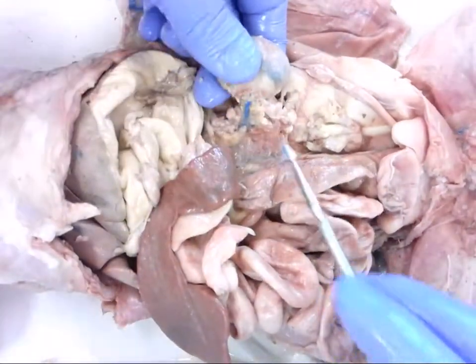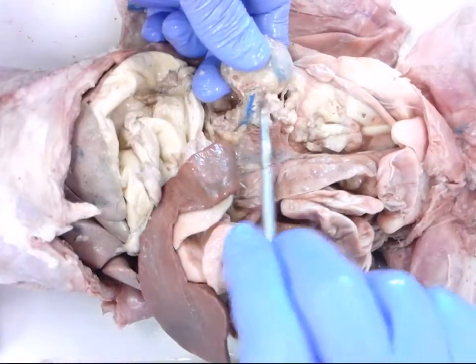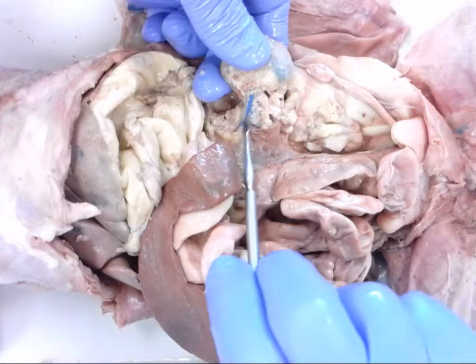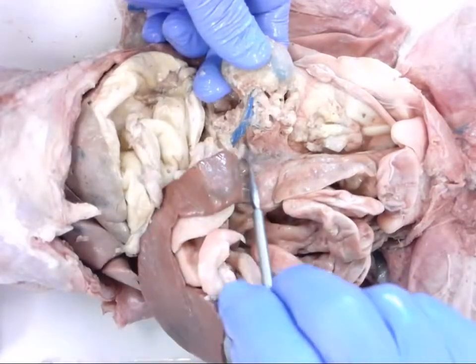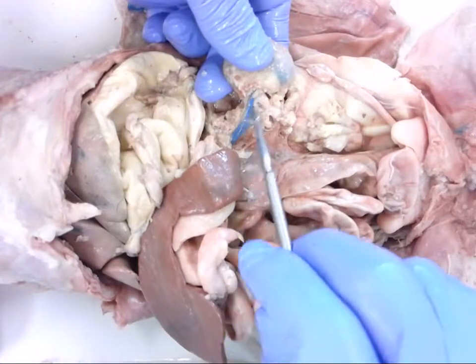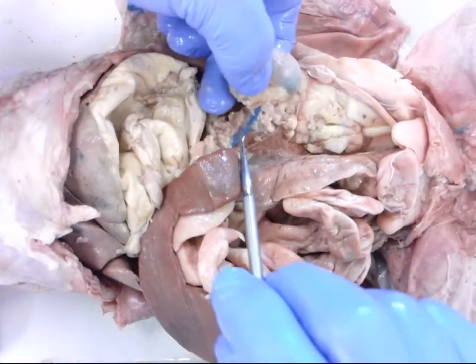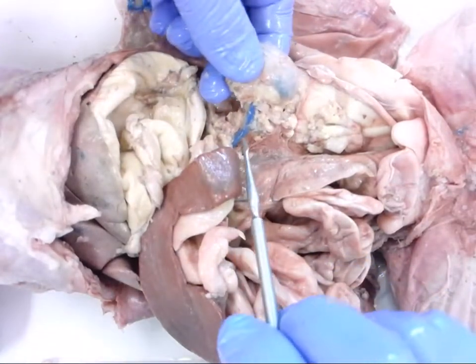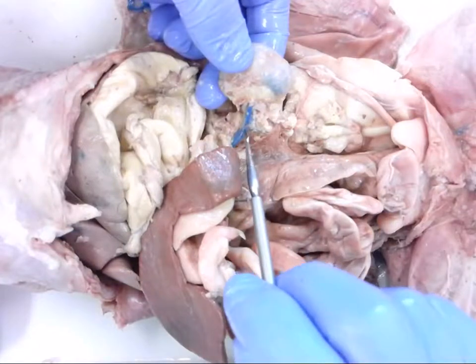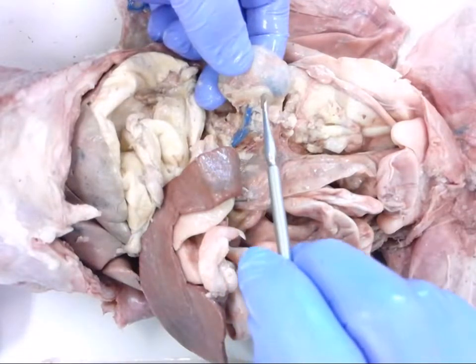Right here, easier to find is the renal vein. Once you dissect that out, you'll see that it continues back over to the inferior vena cava. The renal artery usually sits underneath and sometimes is not filled as well with latex as the vein is, so it's sometimes more difficult to find.